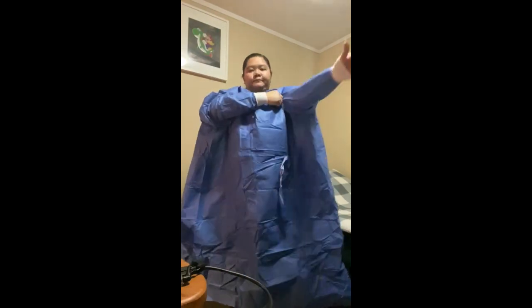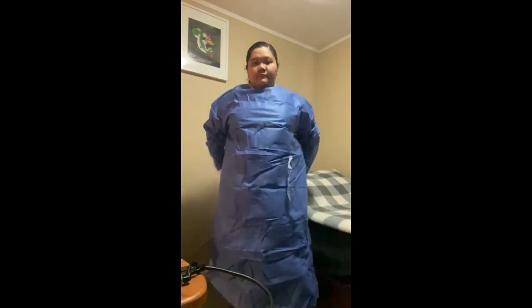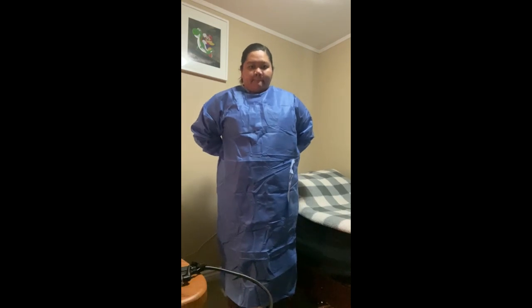Next, we put on the gown. Fully cover your torso and secure the gown around the neck and the waist. This provides a barrier to protect your clothes and skin from exposure to infectious materials.